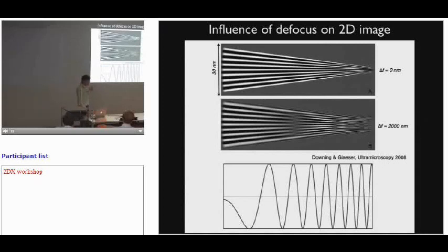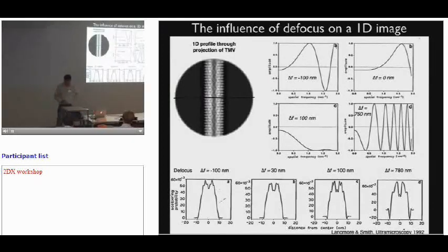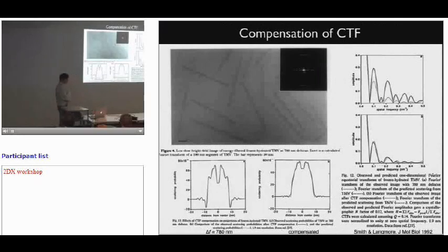So we now get to more applied scenarios, like this one that was done on DMV. If we just look at the 1D profile and take these images at different foci, you can see this is more or less pretty close to focus. If you now slice through this projection here, you see how it changes with increasing defocus. All of a sudden, what used to be a fairly rough edge shows much higher indentation, and the overall shape also significantly changes. And it was clear at that time already that you have to take care of this in order to actually get back to your true object.